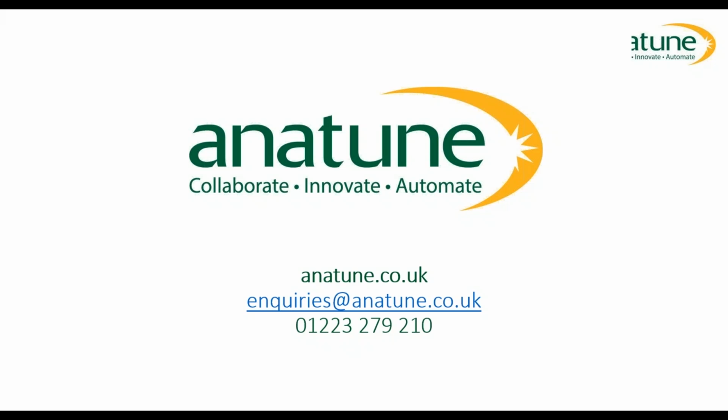So the best approach for this is to actually do an MHE, a multiple headspace extraction type method, where you extract the sample multiple times and fit it to an MHE plot, and then that calculates, using extrapolation, total concentration in the sample. Again, the validation exercise is similar to any other method. I have validated one of these for a GC method before. Again, what you do is you look for things like linearity, precision of your instrument, and recovery into your sample.